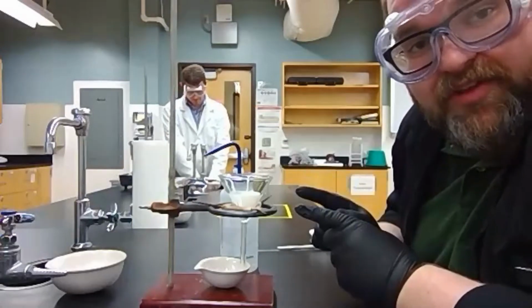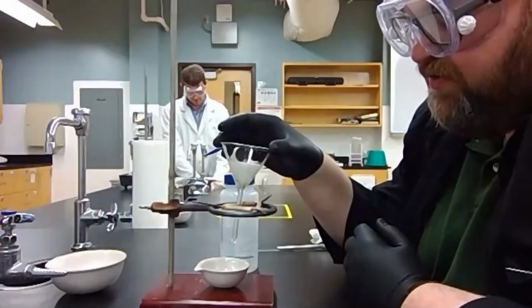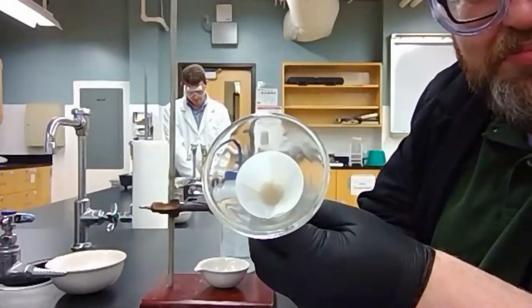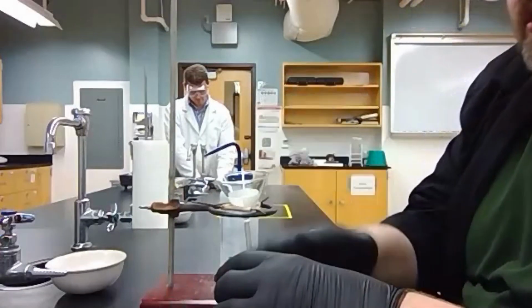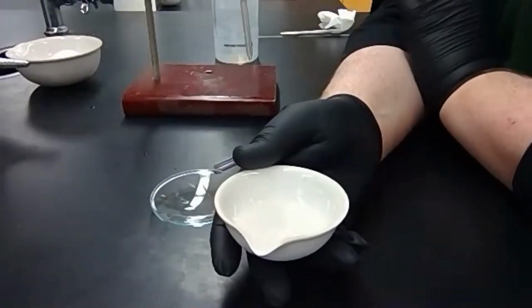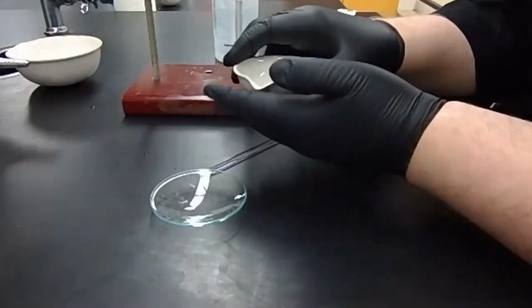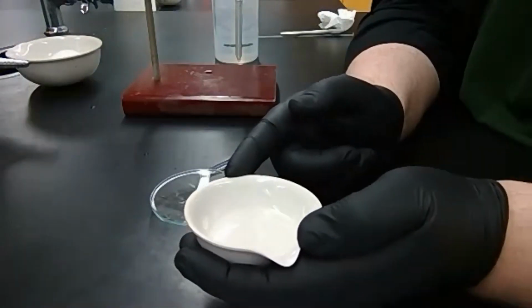So we've given this about 5–10 minutes. That's enough time for it to drain completely. You'll notice that there are no drops trying to form down here, that there's no water puddled up top here, and that our evaporating dish, I'm going to tilt this down, is a little less than halfway full. That's perfect. We want it that low. If you have more liquid in yours, that's fine. As you can see, we've got about half full in our evaporating dish.